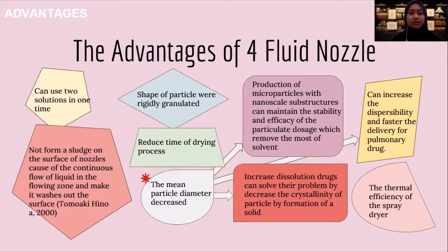And last but not least, the thermal efficiency will be higher when using the 4 fluid nozzle than the 2 fluid nozzle. Also, the amount of particles that will be produced is 400 times more for the 4 fluid nozzle than for the 2 fluid nozzle.